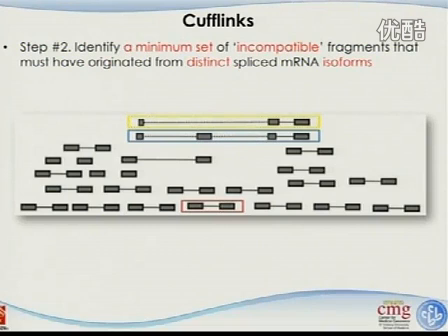Yes? I have a question. So what do the solid and the dotted line mean? Solid is, so this is paired-end. Okay, look at me on there. This is the paired end. So you got RNA fragments, you're sequencing both ends. All right, the middle one is not sequenced, but they are kind of connected. The dashed line here is for this one end, all right, it's across the junction. All right, so they are connected at the RNA level, but once you map it back to the DNA level, they are separated because there is a junction occurring there. That makes sense? Okay? All right.